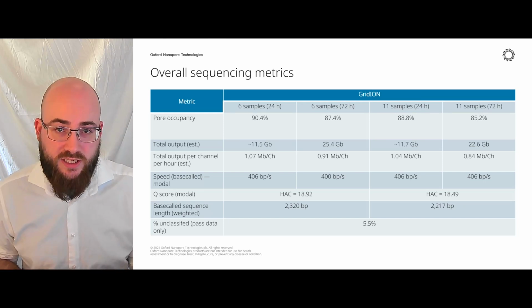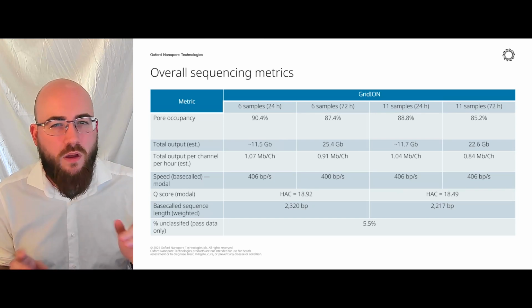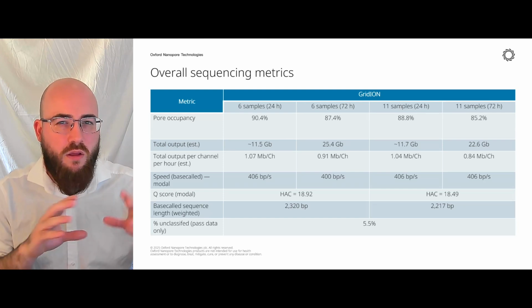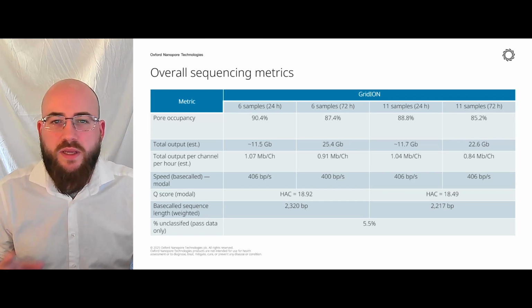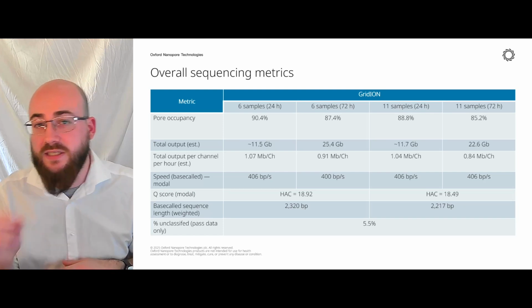What does change here is the amount of data per barcode we're getting. So if you are having to think about something, it'll be that. Think about how much data you need per barcode, per part of the sample. For example, 11 samples here by 22 gigs. What are we getting? 2 gigs per sample. But remember, because they're on separate barcodes, that's a gig per barcode.